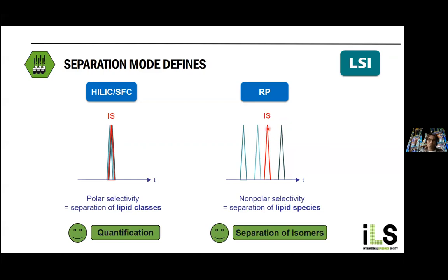There is maybe one solution. You could use a stable isotope labeled internal standard. We heard it multiple times. This is the gold standard for each individual species, so you get a perfect situation. These standards are generated, and there are investigations. I think in Vienna, Harald Schöni has this Lilly internal standard, for instance. So that is some kind of solution to that situation.